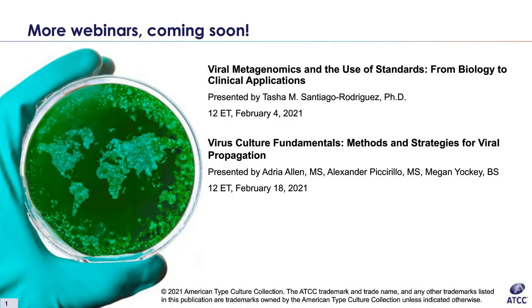Yep. All right. Once again, let's change gears. Let's talk about proliferation assays, or cell viability assays. Which do you guys prefer, XTT or MTT? And is it because one's more sensitive than the other?